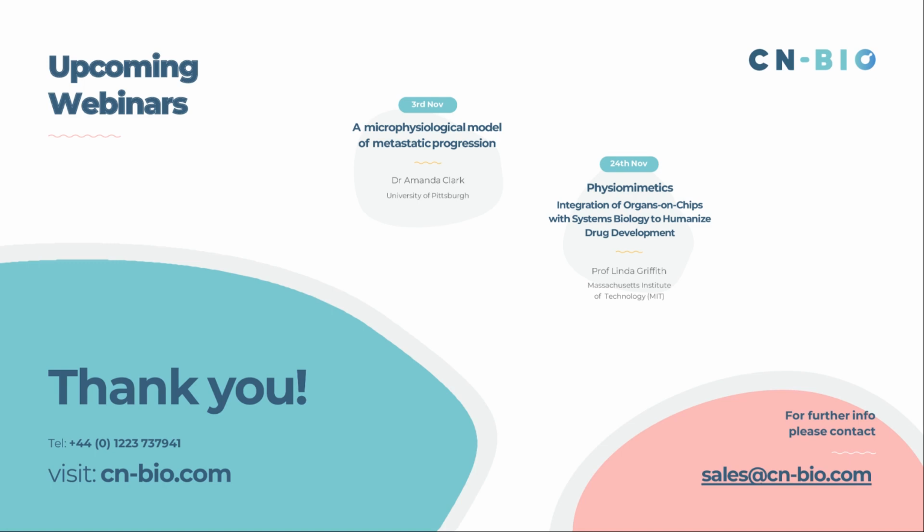Thanks, Becky. Yeah, nice question. So I guess there's actually two questions in there. So the question is how long does it take to induce DILI and potentially induce a disease state? So we can use the system to study both acute and chronic DILI. So we can look at short-term acute responses over 24, 48 hours and mechanistically investigate that.